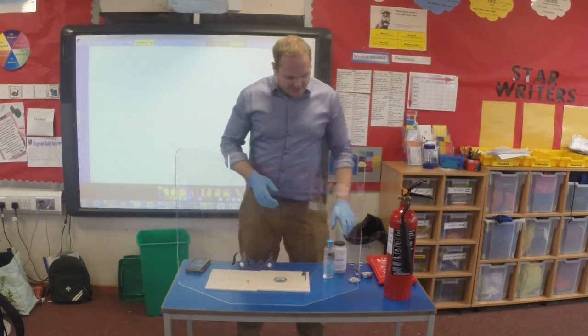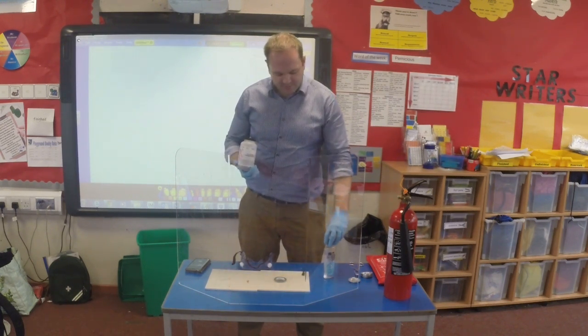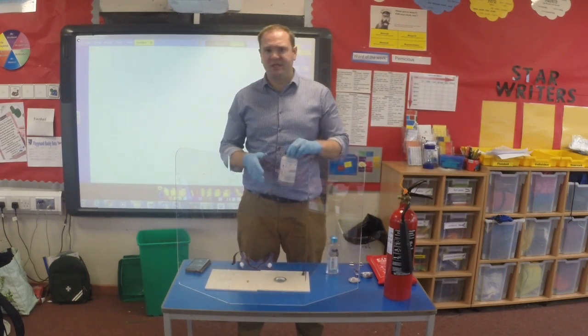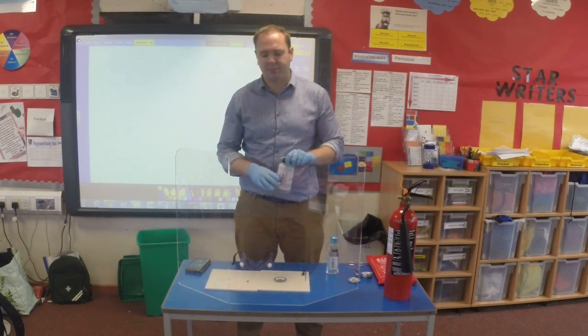Hi guys, in today's experiment we're going to be looking at a fairly exciting chemical reaction between potassium permanganate and glycerol. Now often this would be a high school level experiment, but I firmly believe that this is one that we can do quite safely at primary school as long as we take the correct precautions.